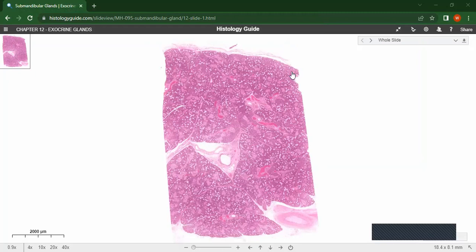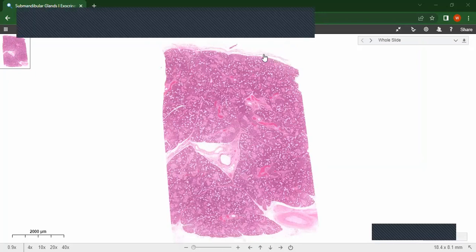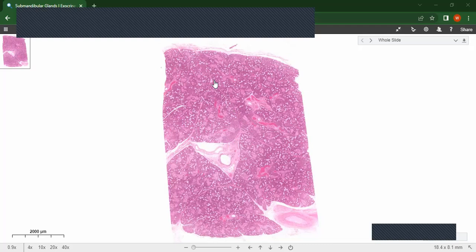From this slide, you can see a capsule here — it is an encapsulated gland. The capsule sends trabeculae into the gland to lobulate it. You can see a lobe here. That is the stroma — the connective tissue framework of the gland.